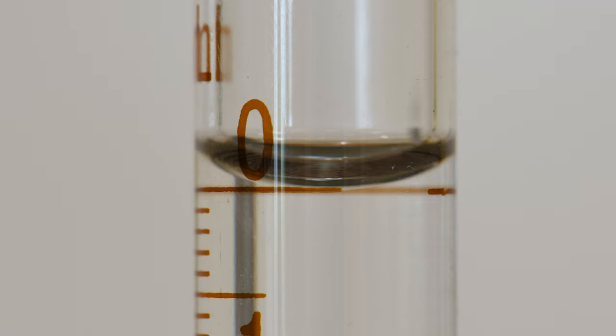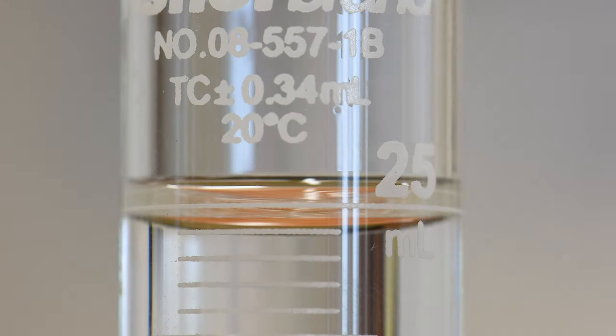Now we're ready to begin testing our unknown hard water sample. So I've refilled the burette to begin the three trials that we'll be doing. So be sure and record this initial volume of the burette. This is the sample of calcium carbonate we'll be using for our first trial of the unknown sample.